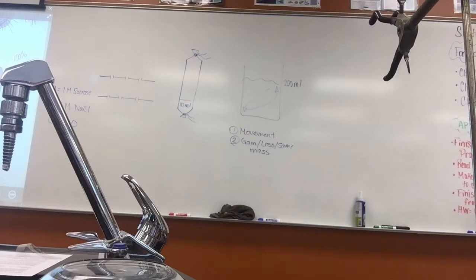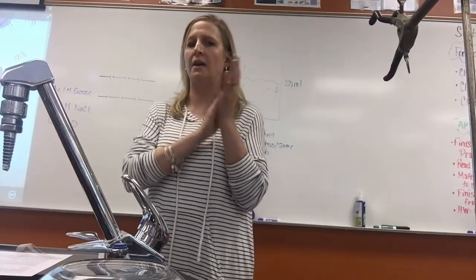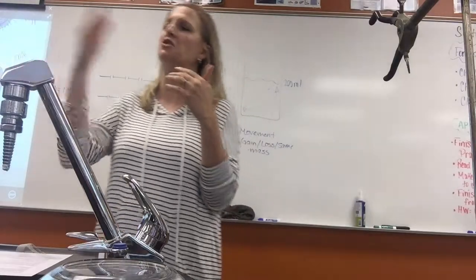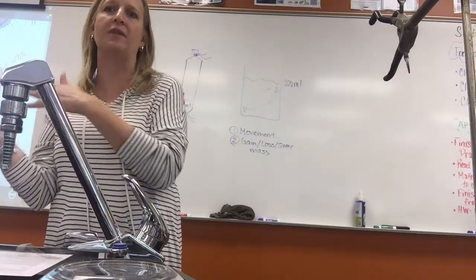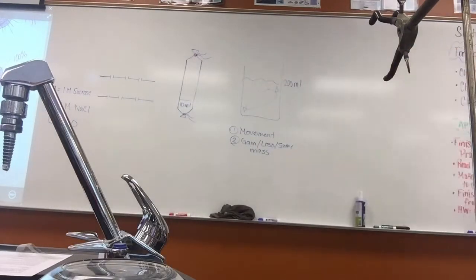You can record how much it gained or lost, but I want you to divide it and give the percent change in mass, so comparing it to the mass it originally came in at, and so therefore you're comparing percentages, and it tells you how to do that. You basically get the difference and divide it by the original mass, all right, to get the percent change. And so that you're going to ultimately calculate as well. So I want to point that out so that you can think about that in making your data table. Okay? So right now I'm going to have you do your hypotheses and the data table. So go right ahead. And you can talk amongst yourselves.